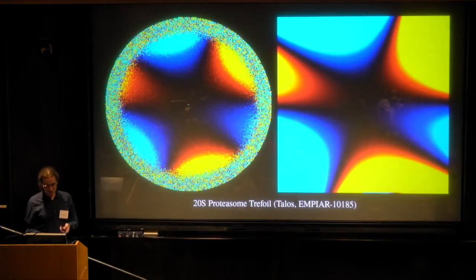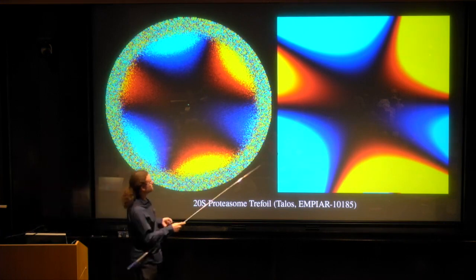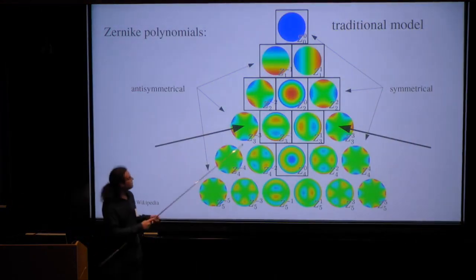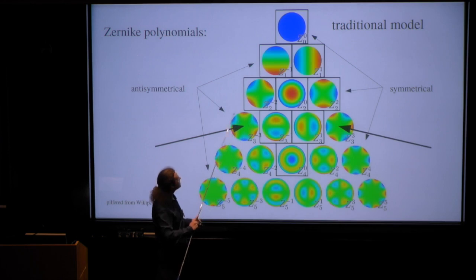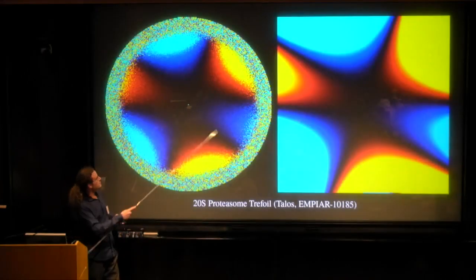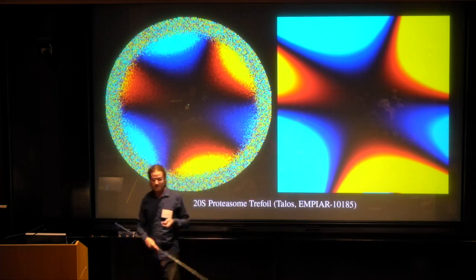And with our new Zernike model, we can now express this quite well. So in this case, it's specifically these trefoil terms. These are the beam tilt terms in the third order. And now, when we consider these, we can also fit something that looks like this, which becomes positive 3 times and negative 3 times.